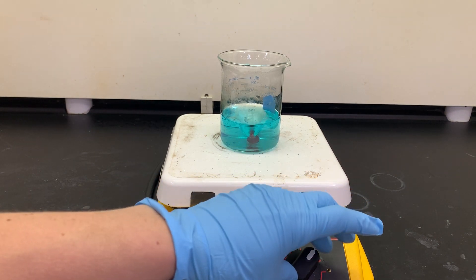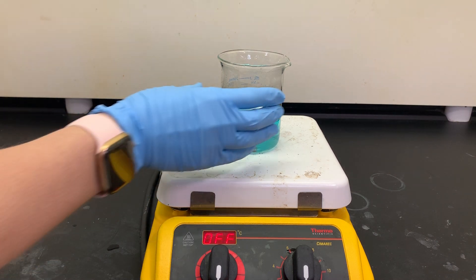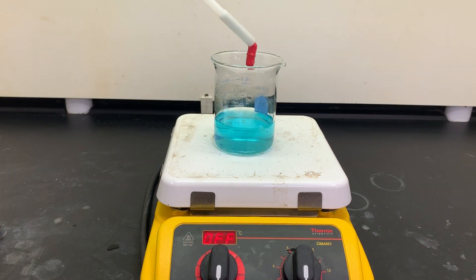It looks like our reaction is complete. Don't forget to make observations of these products. The last thing I want to do is remove the stir bar. When I remove this magnetic stir bar, it's going to have a little bit of that copper solution on it, so I'm going to remove it and then rinse that copper solution back into the beaker so I don't lose any of that copper product.